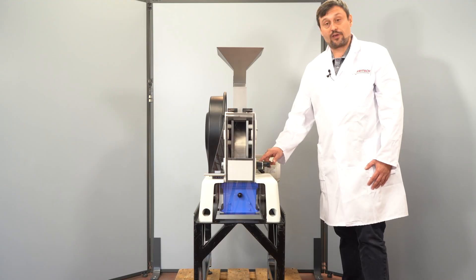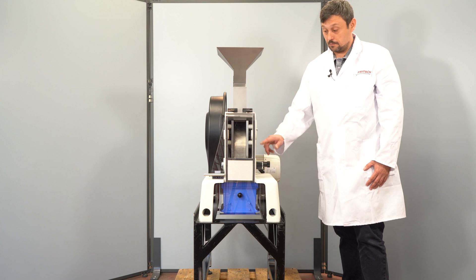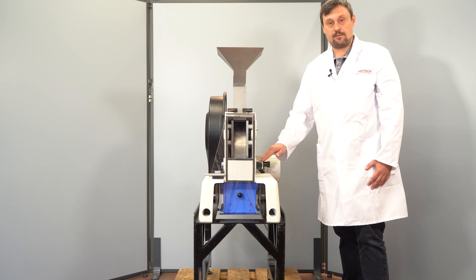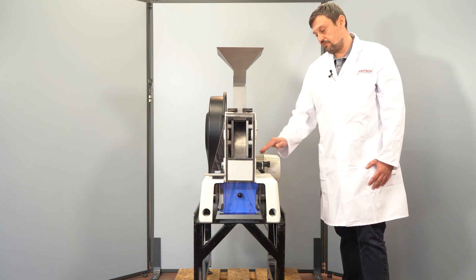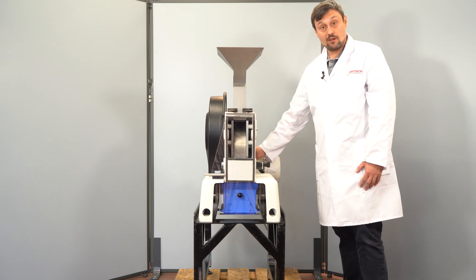We always recommend to pre-grind the whole sample using the biggest or a large gap, and then do the final grinding with a smaller gap setting. We can now start the mill.